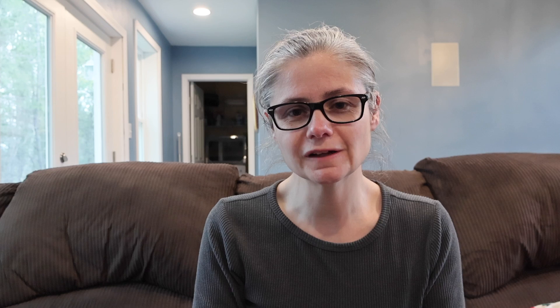The toilet rim. In the before section, we can see a tremendous amount of bacteria — that's a nice sample there. And in the after section, it appears that there's no bacteria. However, I'm going to zoom in a little bit on the picture, and it's kind of hard to see, but there are about 60 tiny bacterial colonies on the other side. So we can most certainly see a decrease in bacteria, but there is still some bacteria hanging around in the after section. Sal Suds does a good job at removing bacteria from the toilet rim.